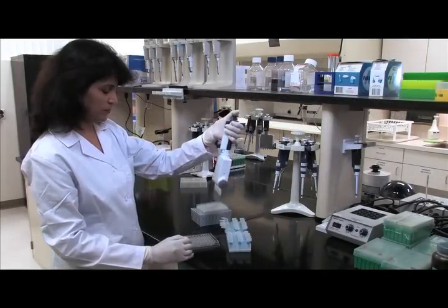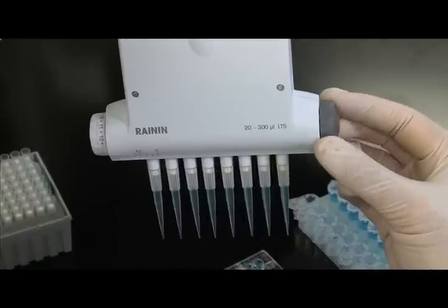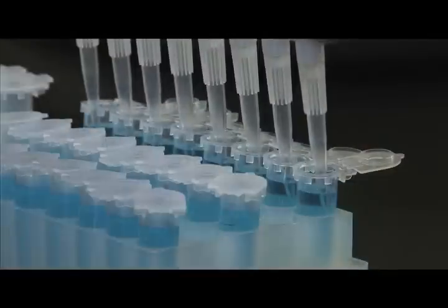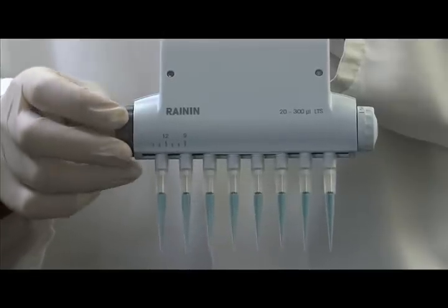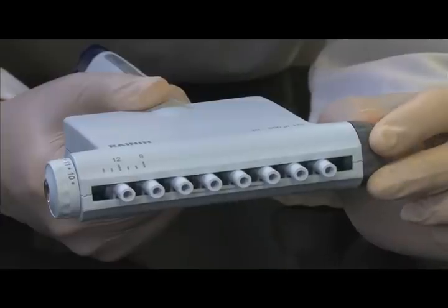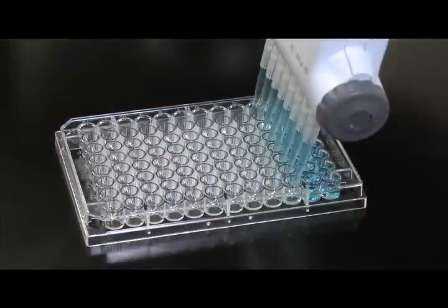With this pipette, a simple twist of the dial is all that's required to change the channel spacing. The convenient millimeter scale and guide assure fast format changes that are accurate and repeatable.